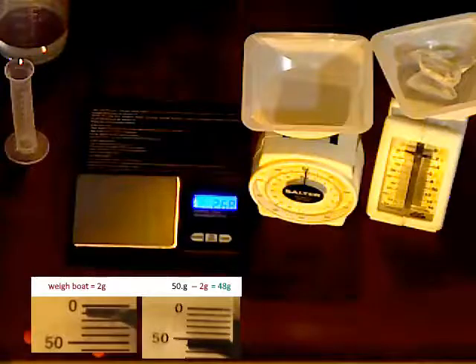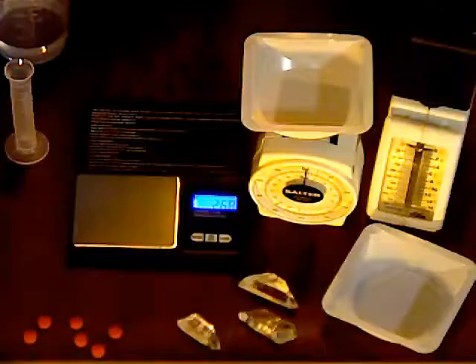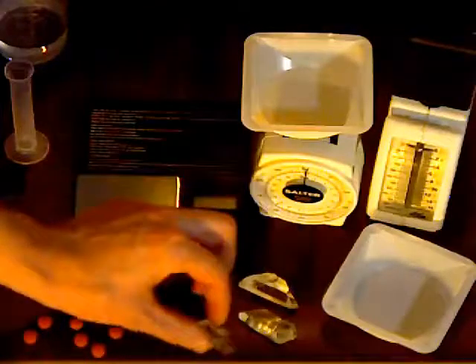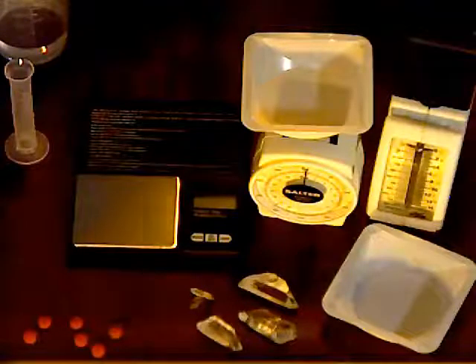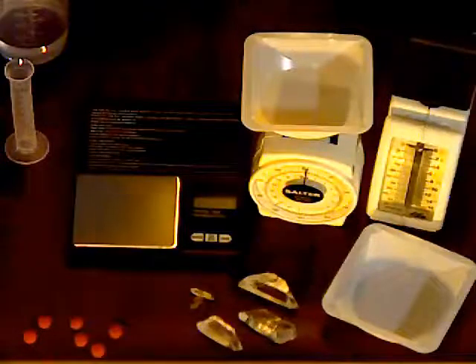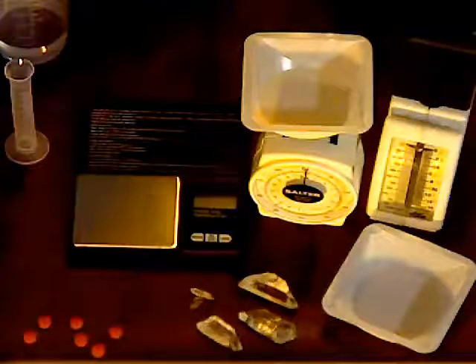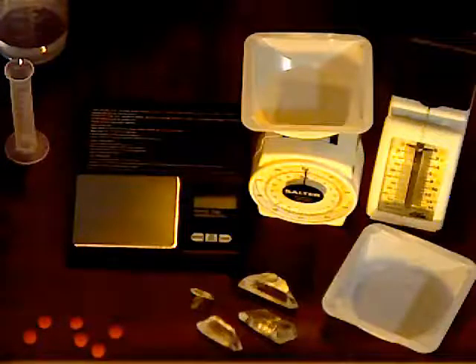There is also a way we can measure things based on their type, that is, their density. Now, if I wanted to investigate whether these large crystals are the same material as the small crystals I started out with, well, density is something that should be about the same. Quartz should have the same density as another piece of quartz, assuming it's pure. Now, some of these do have some impurities. To measure density, I simply need to know the mass and the volume.